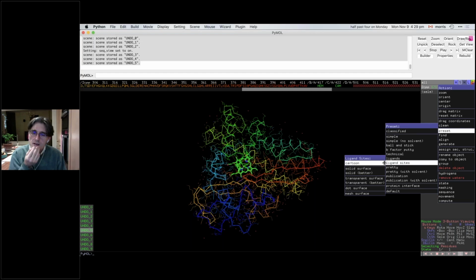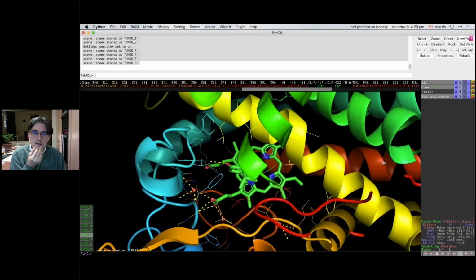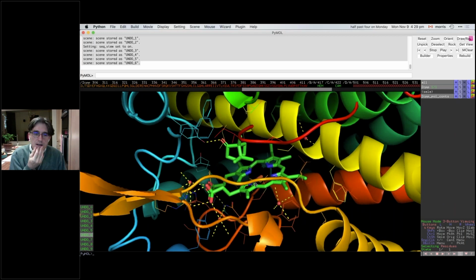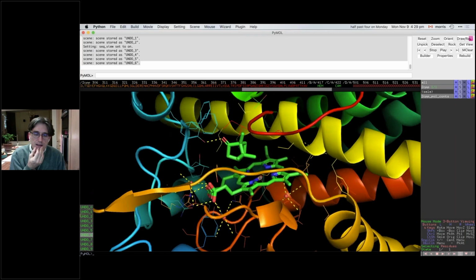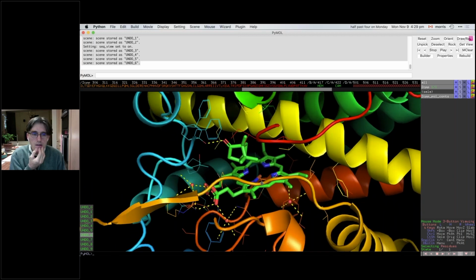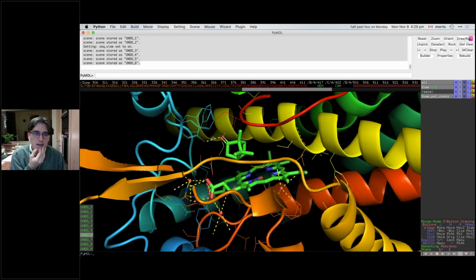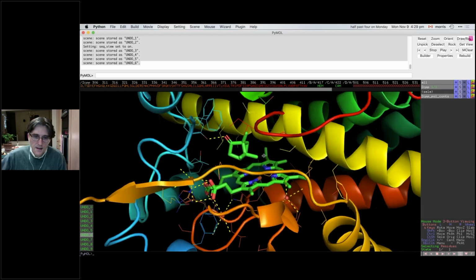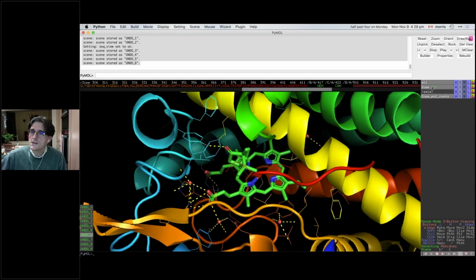So if we do ligand sites cartoon, it's also helpfully zoomed in. What it's done is it's selected all of the cofactors and ligands, and it's drawn polar interactions as yellow dotted hydrogen bonds in this case. The polar interactions are really hydrogen bonds. So anything to the waters or polar atoms are highlighted, and those are all within the vicinity of the site of interest.